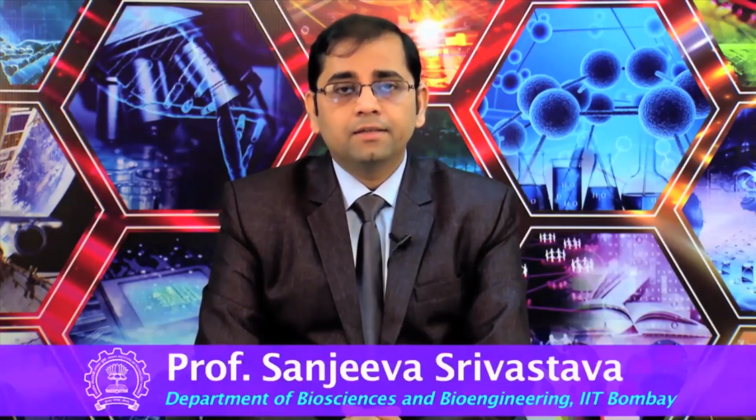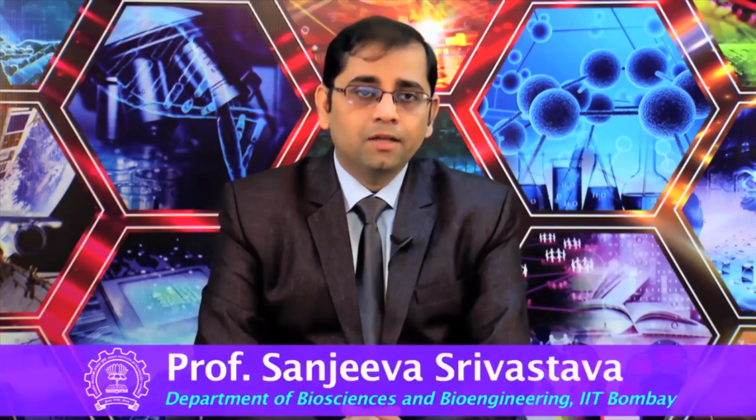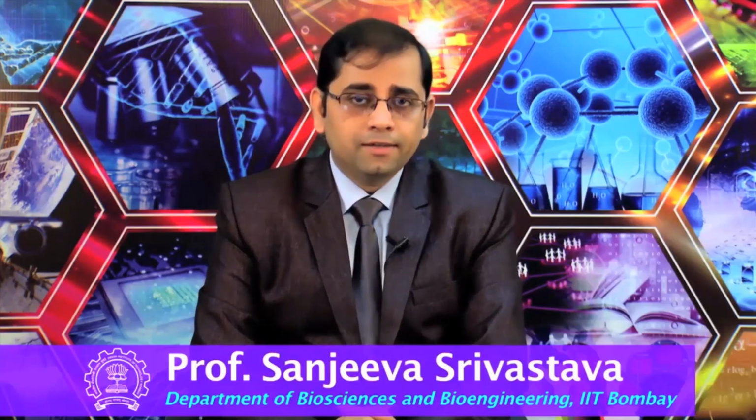Welcome to MOOC course on Introduction to Proteogenomics. After understanding the sequence centric proteogenomics, we will now listen to Dr. Kelly Ruggles, and she will talk about how to use IGV using one of the examples of a human gene.